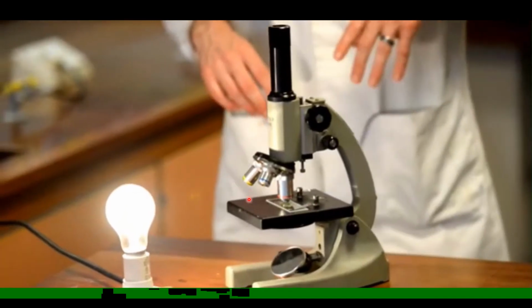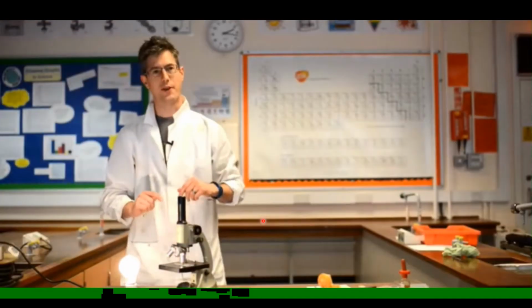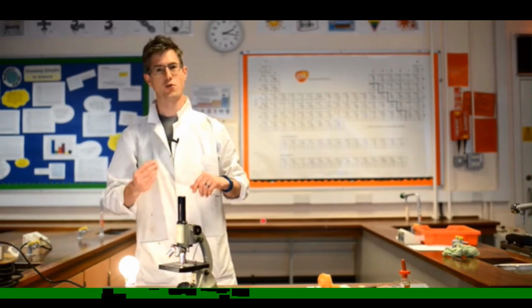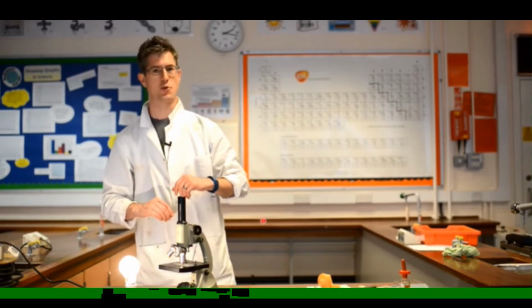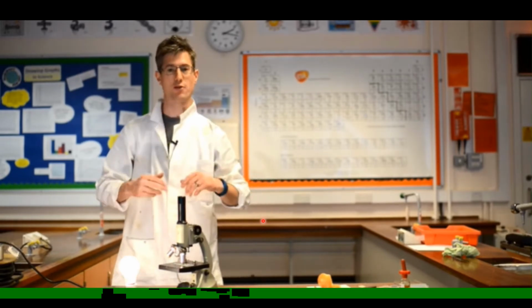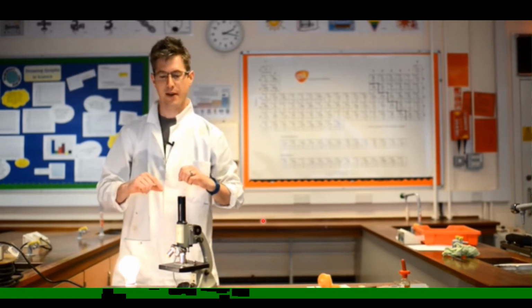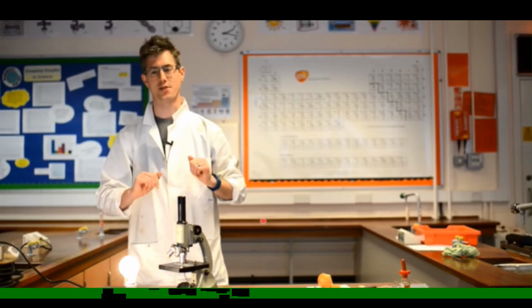So after observing the images, you can copy or draw the specimen in your notebook, and after finishing the observation, it is a must to remove this slide from the stage and clean the stage by using a tissue paper. So these are the main steps that you have to use in using a compound microscope to observe a specimen.